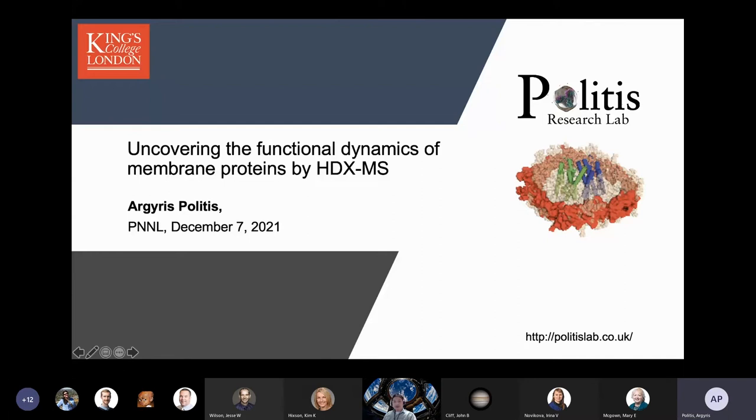Okay, thanks so much for the introduction, and thanks so much for the invitation. It's a great pleasure to present my work to your institute. Today I'm going to talk about the work we've been doing the last few years in my group, using different biochemical methods in combination with hydrogen deuterium exchange mass spectrometry, but also computational tools in order to understand the functional dynamics of membrane proteins.